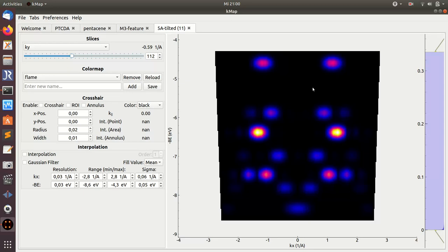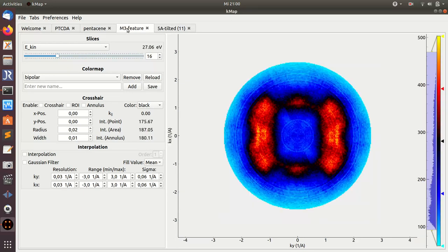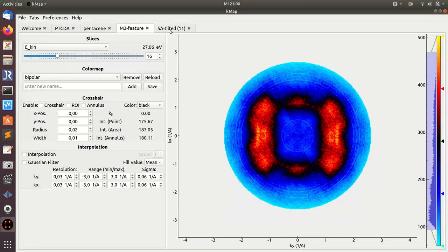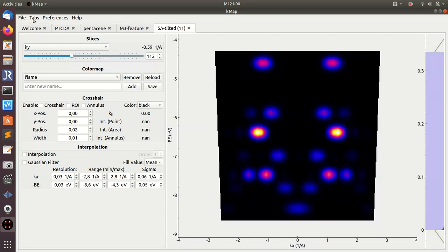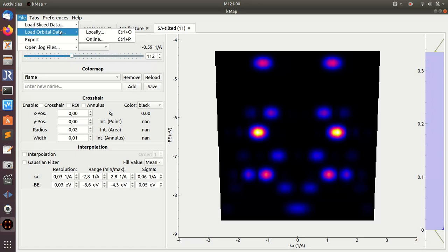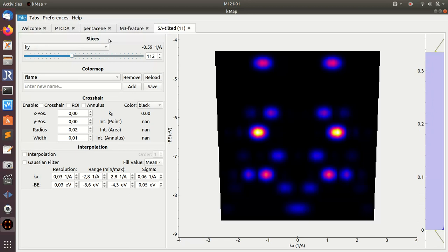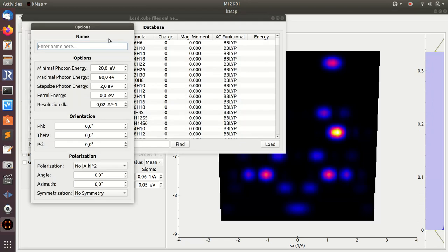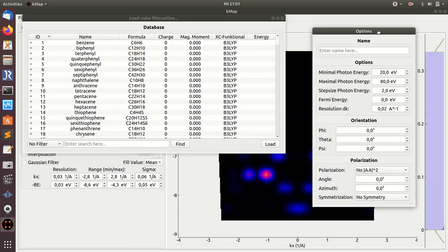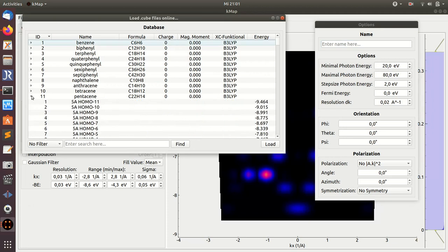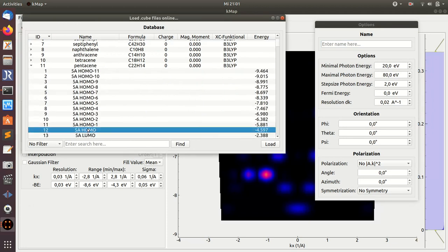So this is a second way to create such sliced data tabs here. The third way is also from gas phase orbitals, but now loading only one gas phase orbital but changing the photon energy as a third parameter. So let me choose again, once again, pentacene, say pentacene HOMO.